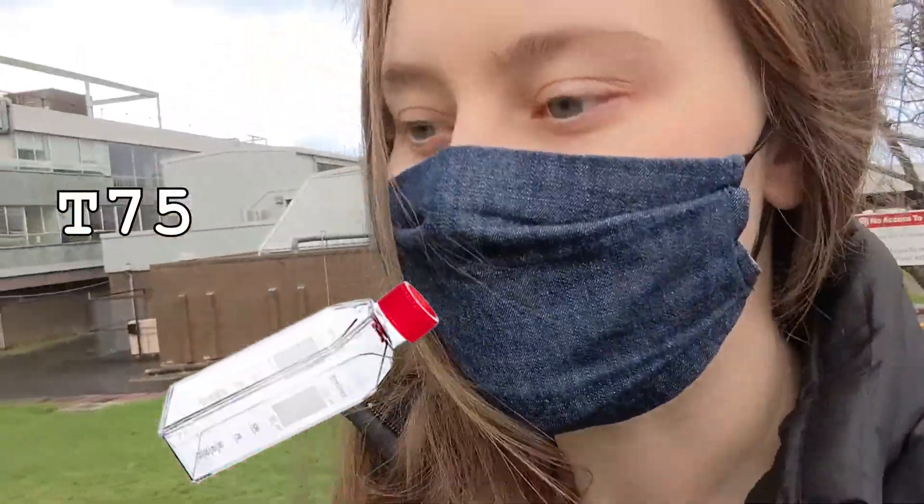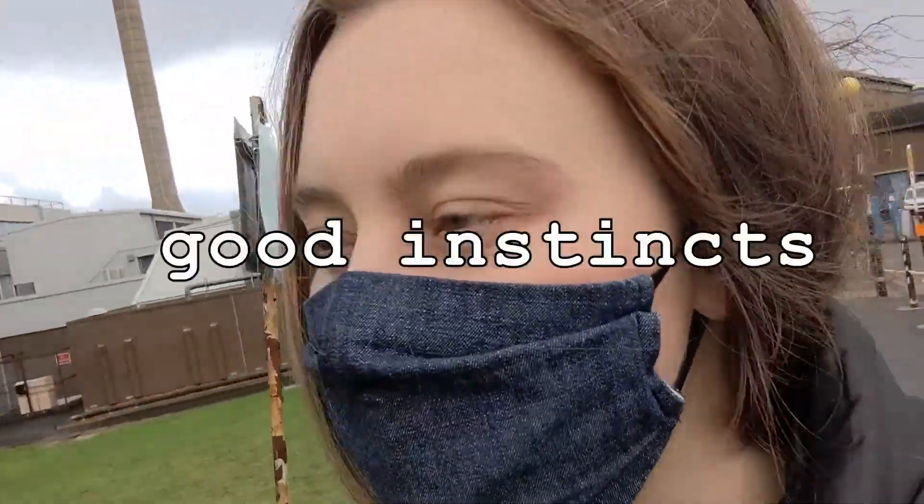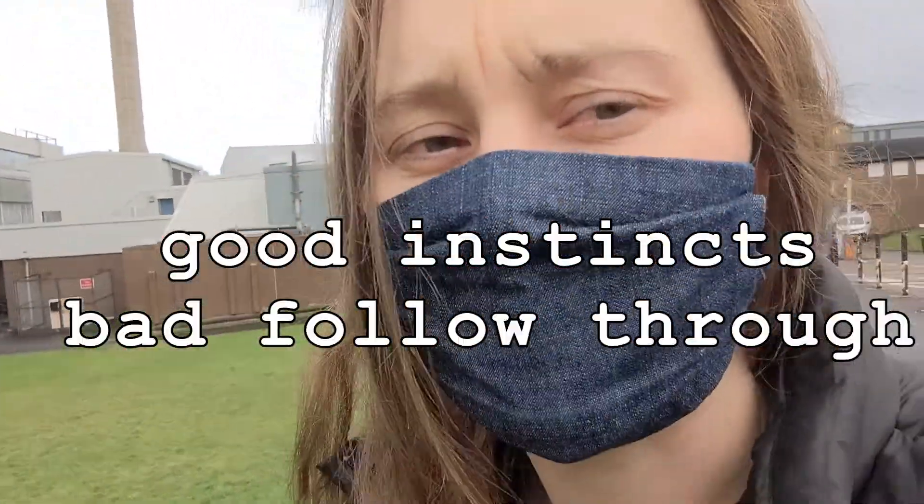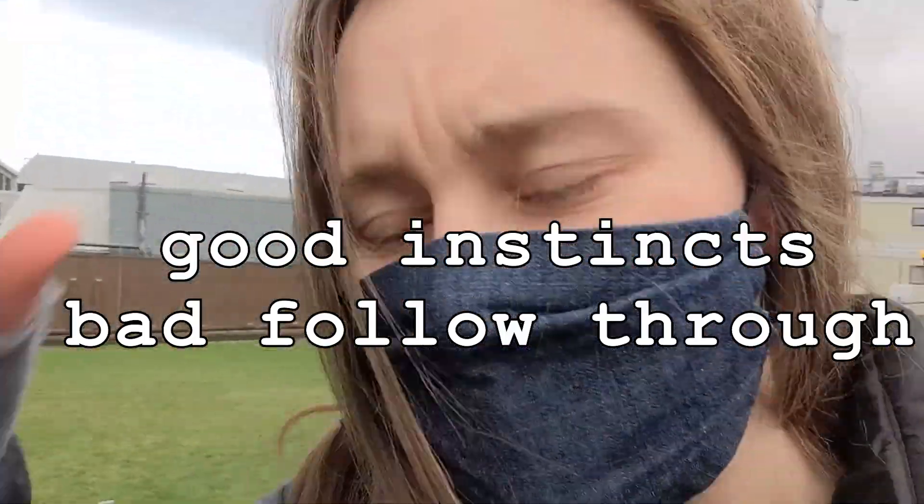That went about as easily as expected, but I did stuff something up. We have an aspirator — a pump that takes out all the media and liquid from your T75, the little receptacle your cells are in. I was looking at it and thought that rubber tip end is pretty unclean and I'm about to put that into my cells. I figured I'd spray it down with ethanol, but it still felt quite unclean.